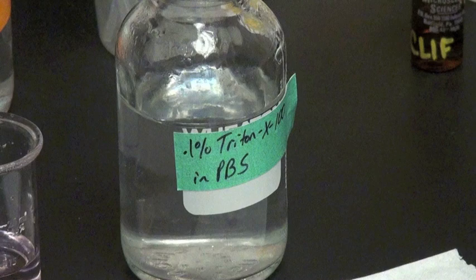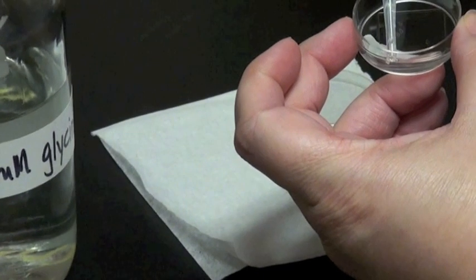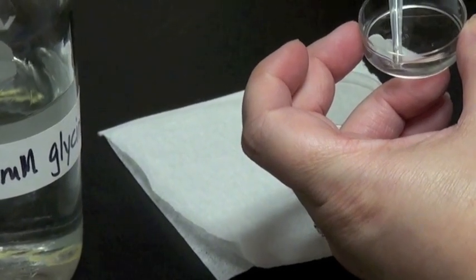These are all great detergents to use, but they all need to be made fresh. So it's not okay to leave a 0.1% Triton X-100 sitting on your bench top for up to a month. After a while you're not going to get very good permeabilization and you're not going to get good staining as a result. I'll remove the 20 millimolar glycine.